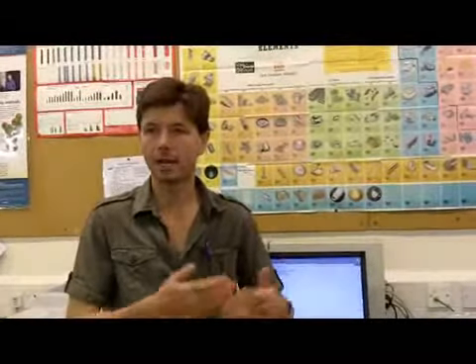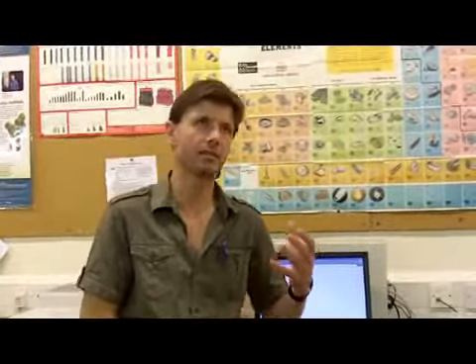It's also quantitative because the number of electrons produced is related to the number of atoms on the surface. So we can calculate how many atoms, and of what type, are present on the surface. The way you do that calculation is you take the area of the peak and multiply it by a factor which we can work out, which is given to you in the manual. Taking areas of peaks is a bit of a problem.